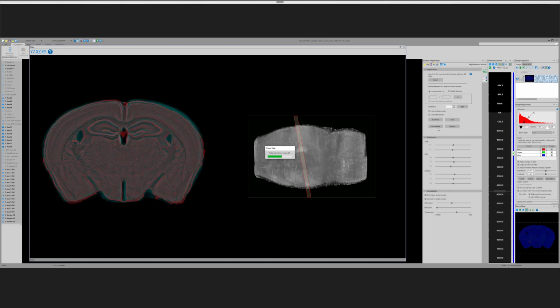With linear registration, we're mapping a plane onto a plane, and straight lines stay straight. With nonlinear registration, the straight lines don't stay straight anymore, so we can have local deformations that better match the structure we find in the brain. And Chip, when this finishes, could you take a look at some of the regions and show how we can draw contours around them and look at the anatomic structures that are mapped in the Allen atlas?